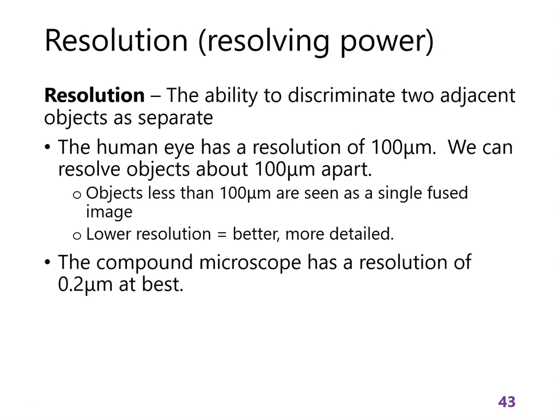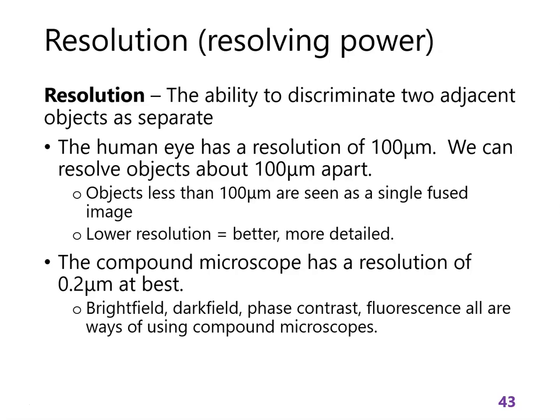In a compound microscope, the type that you use in a laboratory to look at histology, and the type that I use in a microbiology lab, can generate resolution theoretically of 0.2 micrometers. So that's about the best you can ever expect to get with a compound microscope.